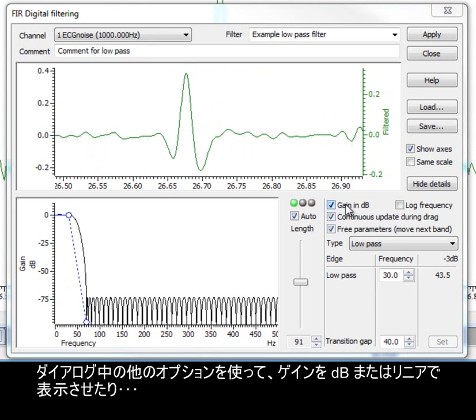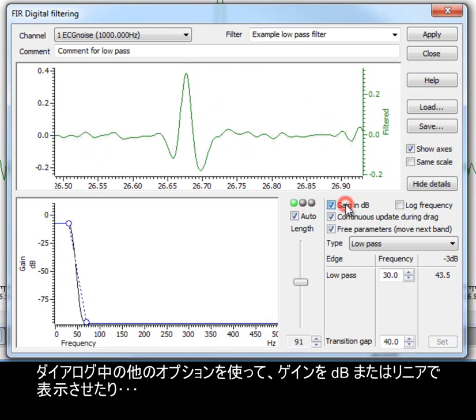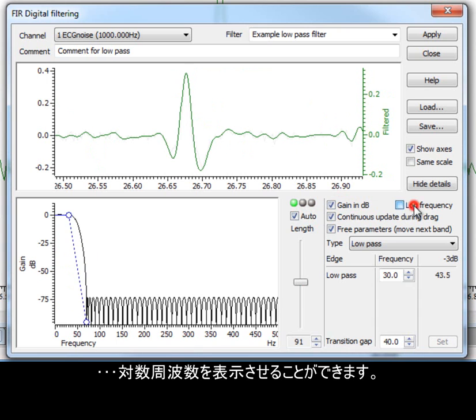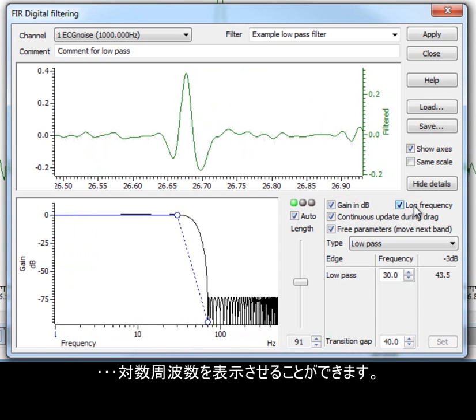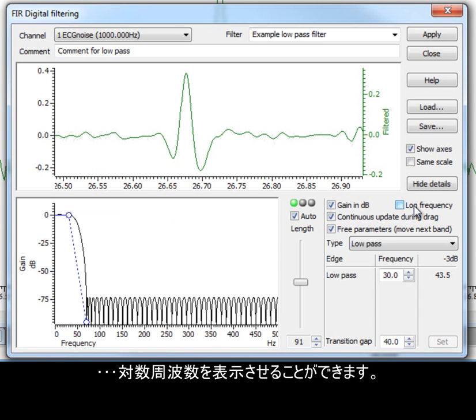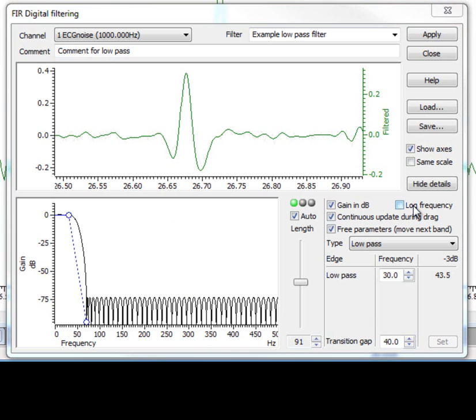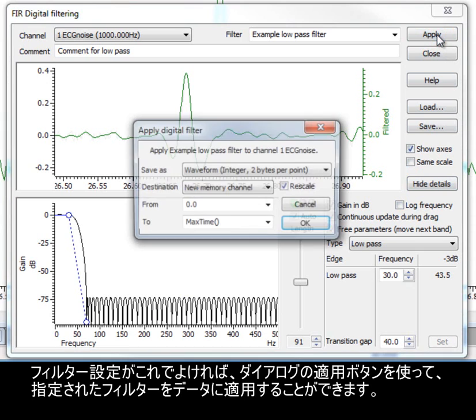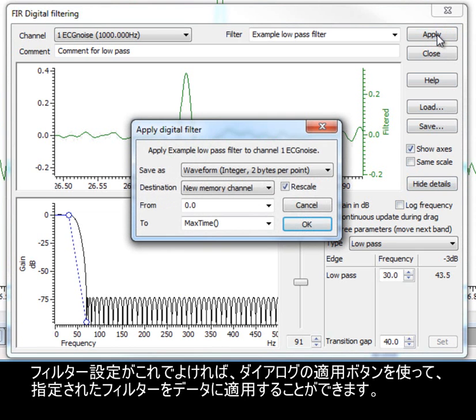The other options in the dialog allow the display of gain in dB or linearly, and display the logarithmic frequency. Once you are happy with the filter settings, we can apply the given filter to the data, using the Apply button in the dialog.